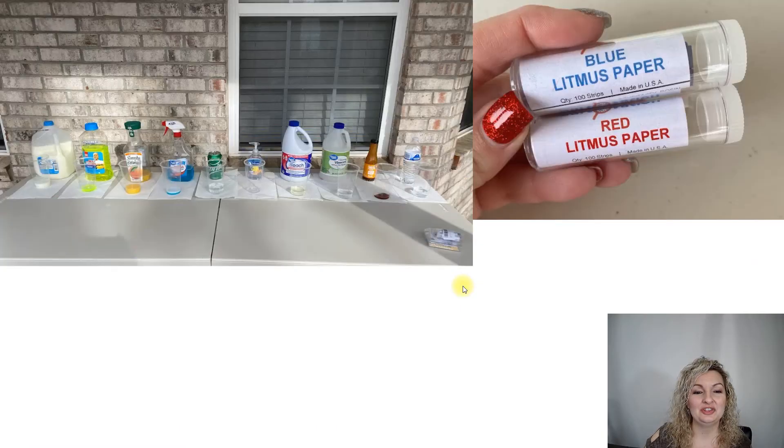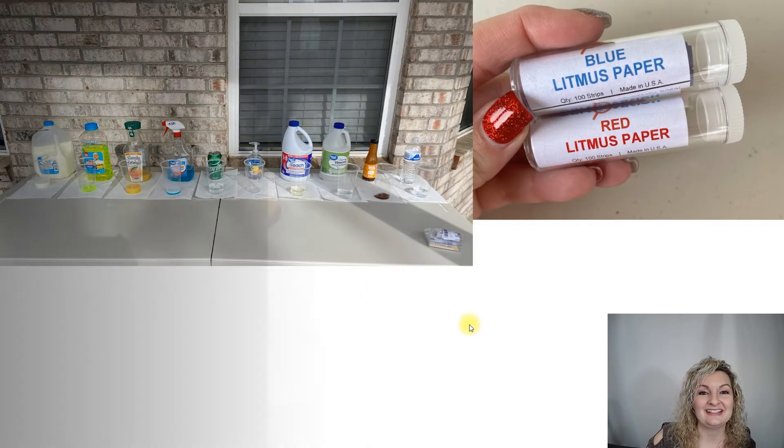Now let's look at our substances. I've lined them all up on a table, put a little bit of each sample in a cup, and we're going to dip our blue and red paper into each substance and see what color it turns. Now is a great time to make predictions — which one is an acid, which one is a base, what color will the litmus paper turn? Pause the video and do that, and we'll get right into the lab.